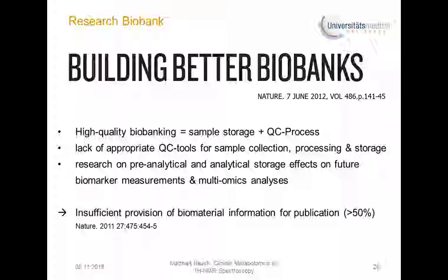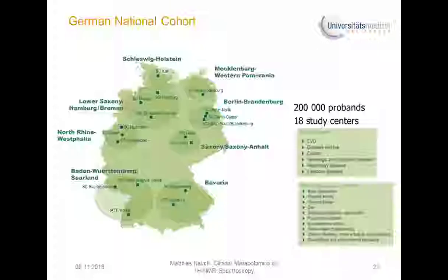And in many situations it is written that there is an insufficient provision of biomaterial information for publication, stated in Nature in 2011. So it's one of our main aspects to be very careful with our samples and to make the processes sure. And of course we are interested in quality control aspects so that we can state that our samples are okay, which we use for our efforts.